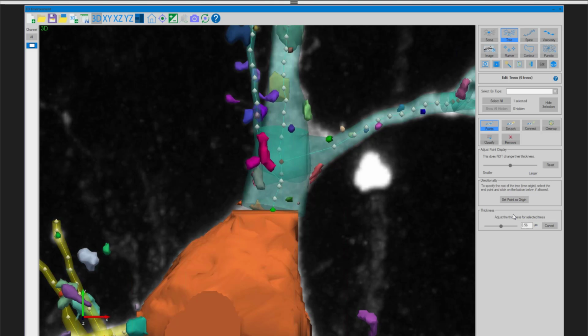What that's saying is, in this data file as it exists, this specific point, which we would understand is the origin point, the closest one to the soma, so naturally that would be the start of the branch, is not being reported as that starting point.